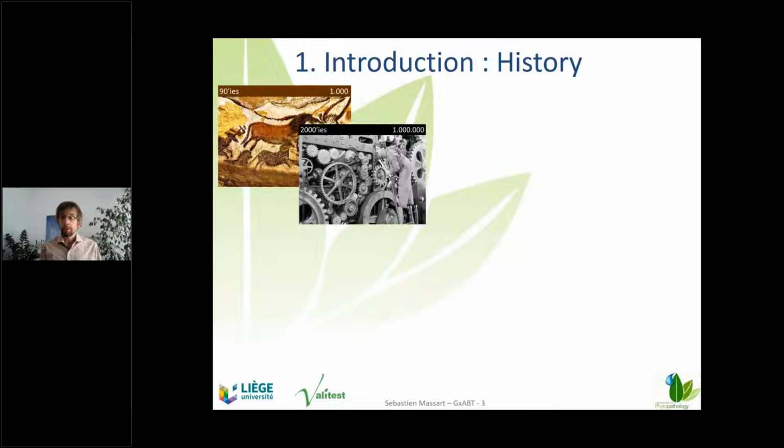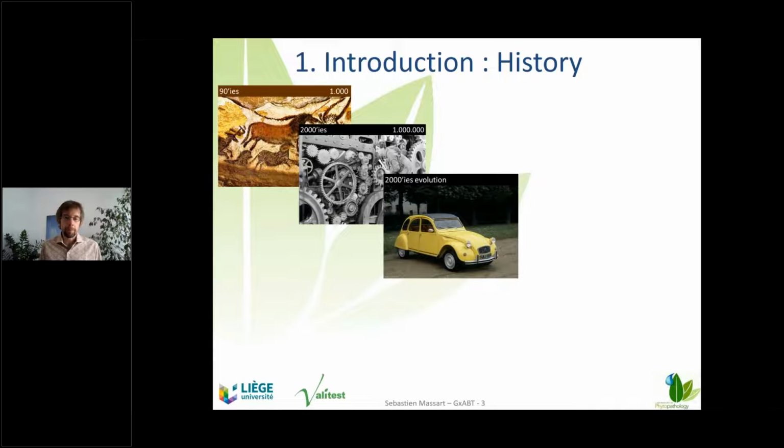That was the time of starting the sequencing of the human genome, which was published in the early 2000s. This was a big project with hundreds of scientists and billions of euros of budget, mainly carried out in the United States. This project also allowed to progressively improve the throughput of sequencing and correspondingly to decrease the cost.